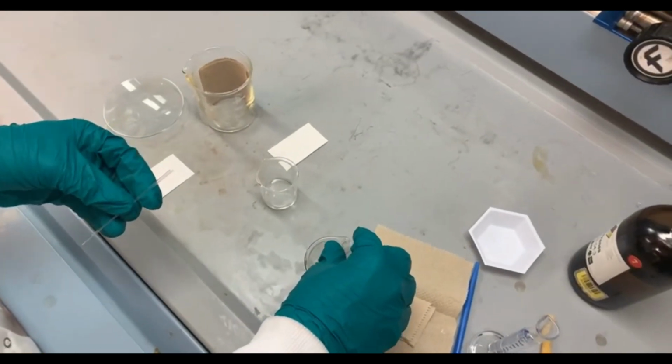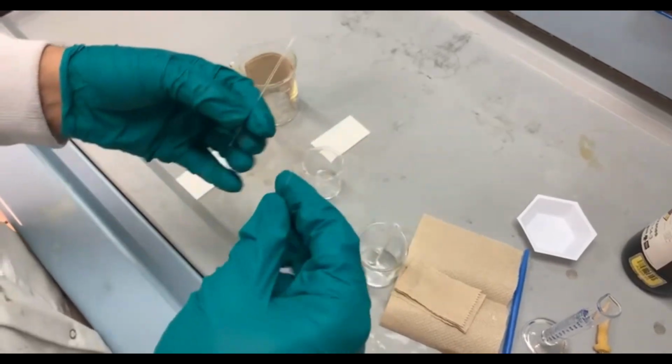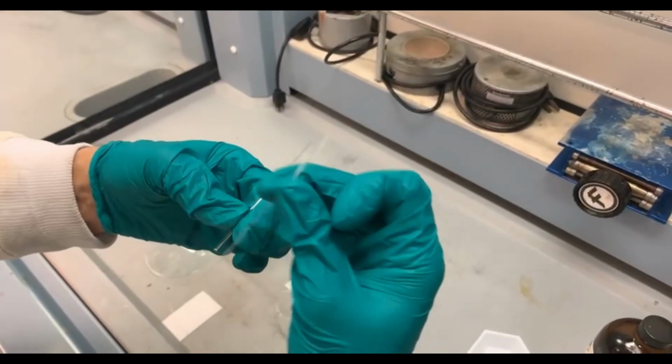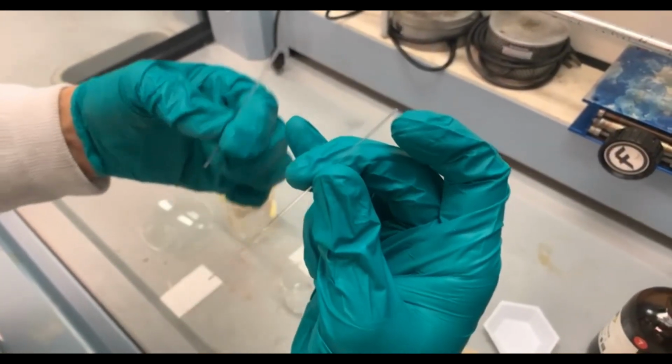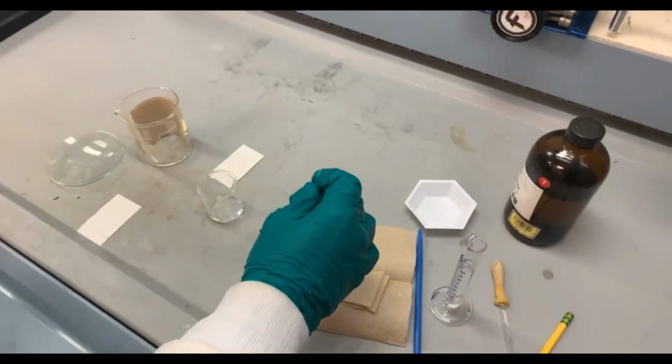And then to spot it, we're gonna use a capillary tube or a spotter. So this is the difference between them. This is a melting point tube, and this is a capillary tube. It's open on both sides, while the melting point tube is sealed on the end. So we just dip.